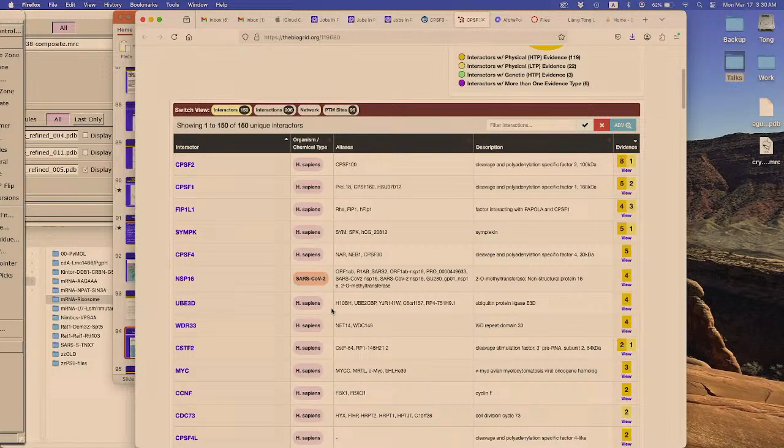So the way I show whether they are complex or not, I use AlphaFold to predict the complex. See whether AlphaFold can predict the complex for me. If it cannot, I say, forget it, move on to the next one. So I manually screen through this list right here, one by one. And I found one. And that protein is this one right here, UBE3D, which now is pretty high up because since I found it, many people publish on that. So now this is updated all the time. So when I was doing it, this is way down the list.